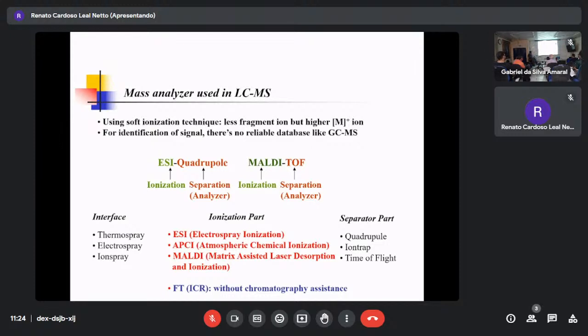And ESI, electrospray ionization, APCI, atmospheric pressure chemical ionization. What's the difference between them? This one is not often used in GCMS, but this one is an ionic kind of ion. I explained EI to you. I explained ESI to you yesterday, passing the nozzle. Then what's the APCI? When you buy an MS, APCI is always an option. You can change it, but we are not using it often. What's the APCI mechanism? It's similar to EI and CI, ESI and APCI.